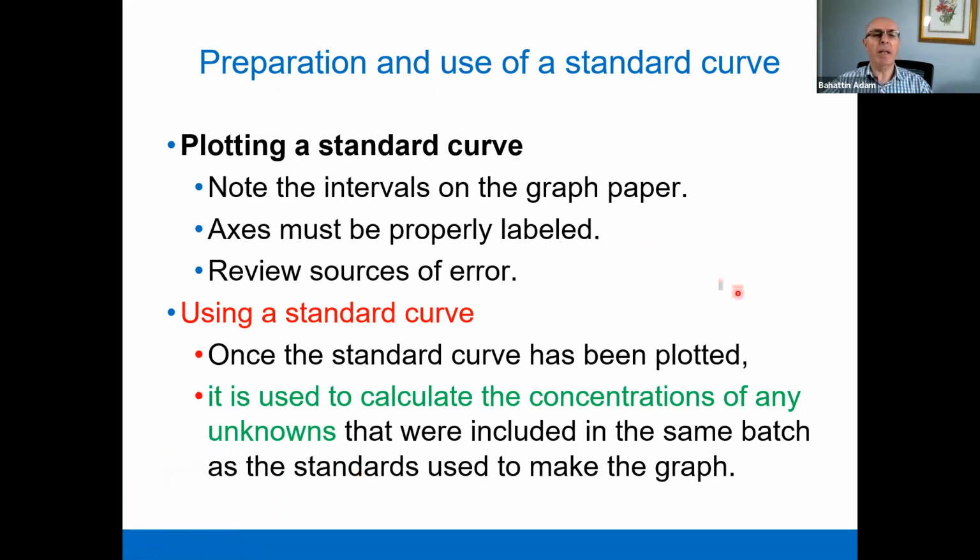Now, note the intervals on the graph paper. In order to plot a standard curve, axes must be properly labeled, and you also have to review sources of errors if you notice any.